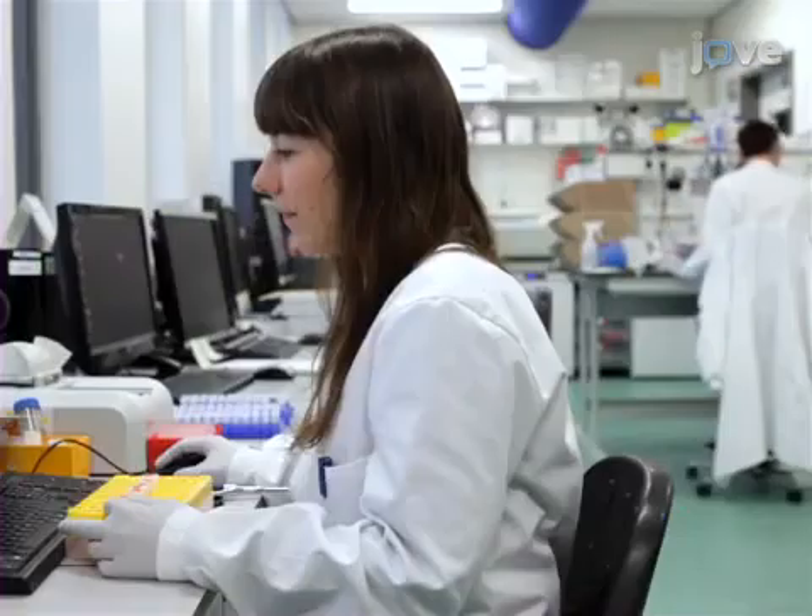Demonstrating the first step of the procedure will be Sarah B. Estrich, a PhD student from my laboratory.